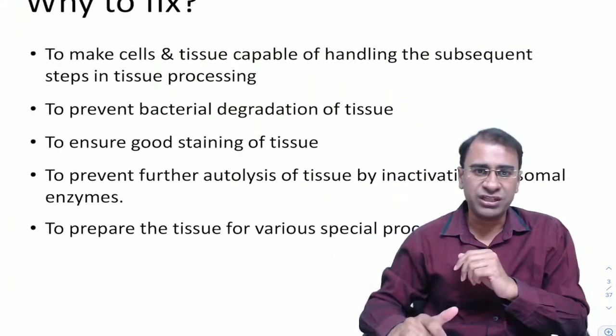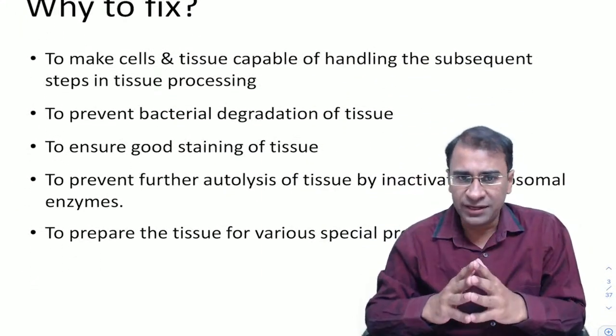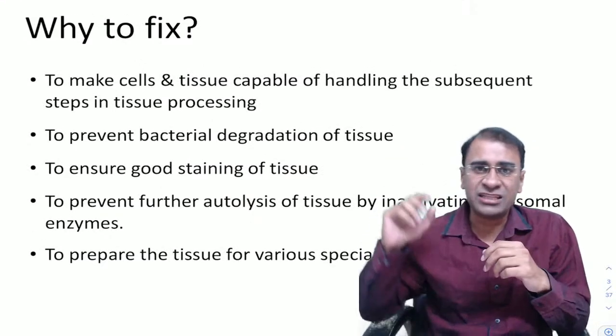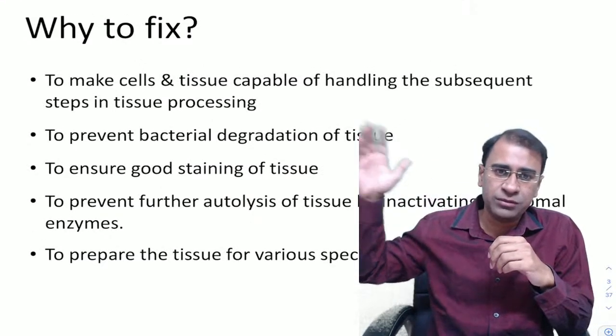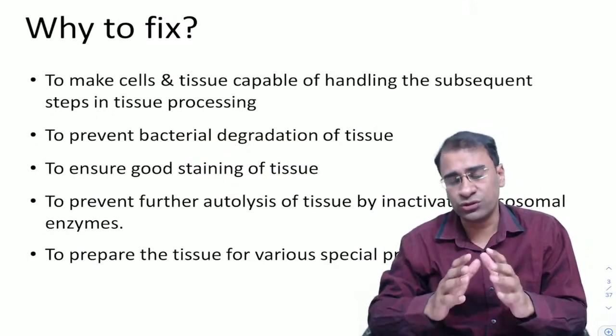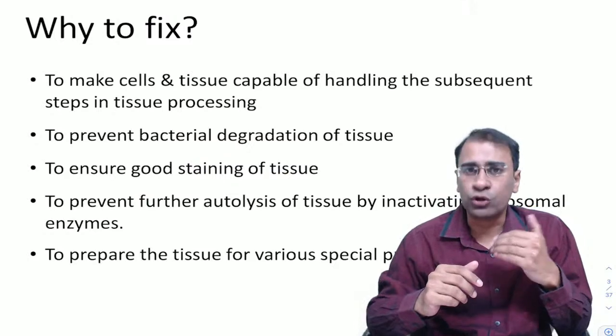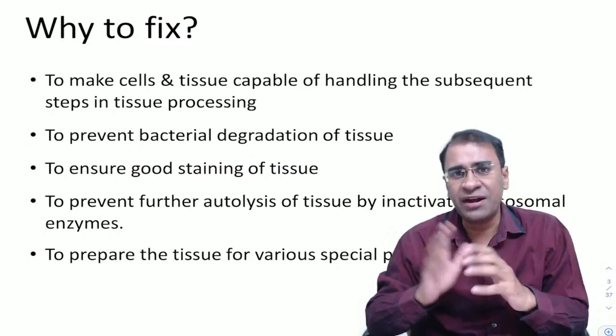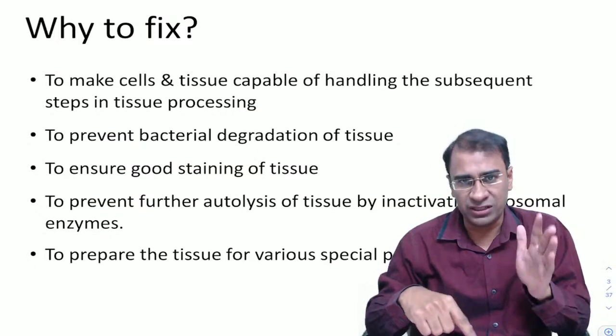So what are the advantages? It ensures that the tissue does not undergo bacterial degradation. It will ensure good staining. It will ensure that the tissue is not autolyzed by lysosomal enzymes, and also a special stain, when done, will take up the stain very fast.